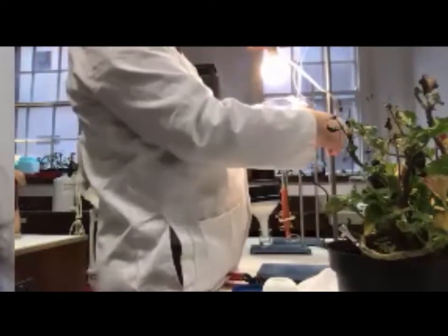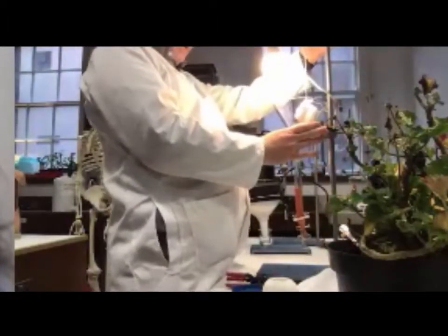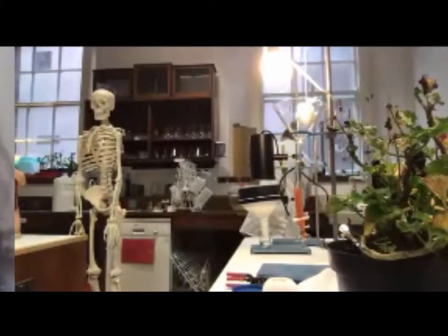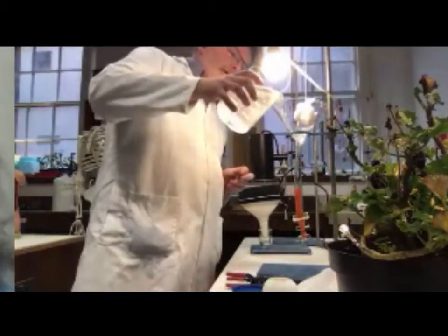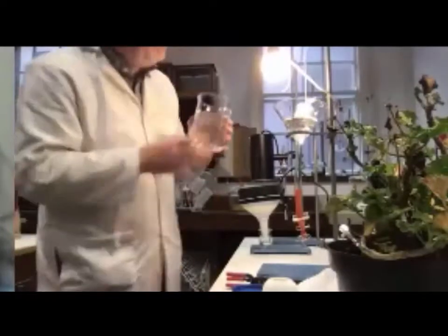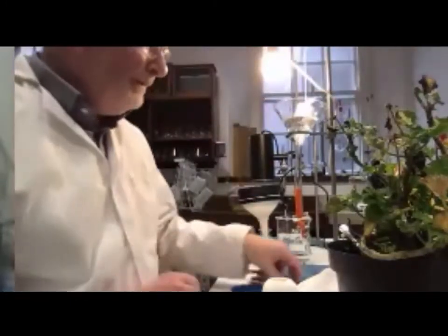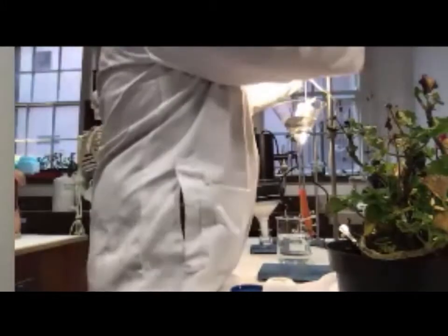And this is the thing. Now, you can see it's quite similar, but we're not going to put a gauze in here this time. We're going to put water. What we do is we bring it up until the water touches the bottom of the little sack. Of course, it's going to absorb into the soil, and that's going to draw out the small beasties, the ones that we want. And the ones that we want, as I said, are nematodes. Okay.